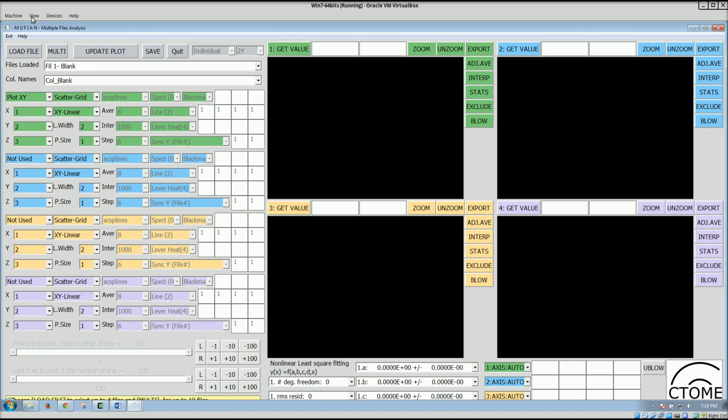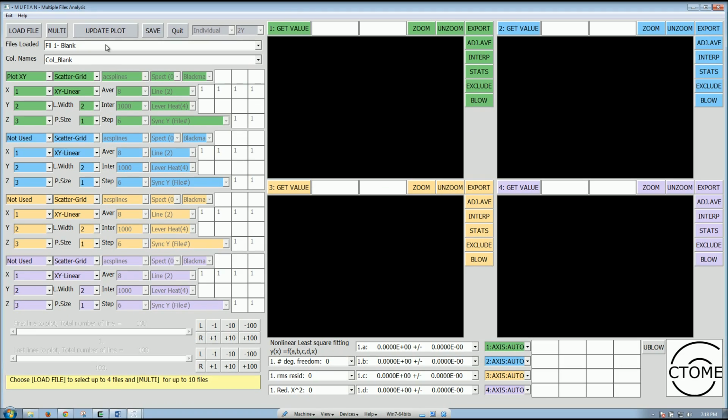So just a very broad description of this module. If we look at the different elements, there is a top bar here with some buttons. Two of those are dedicated to loading some file. This update button is a button that you will push often.